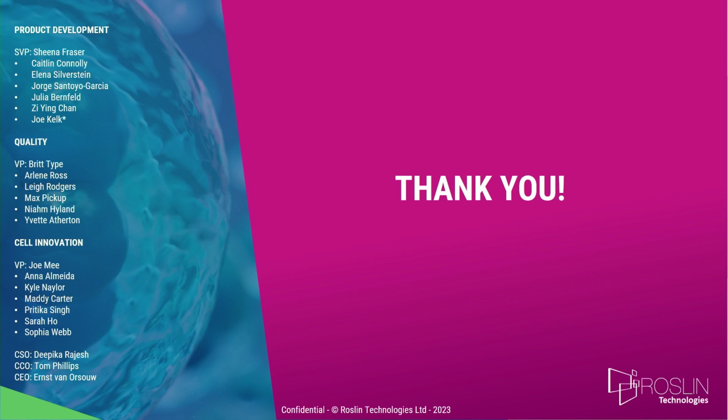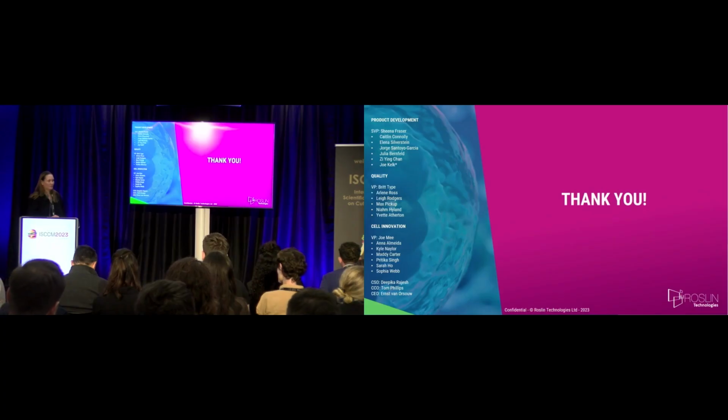There's another question up here. Perfect. Thank you for a very nice talk as well. I noticed you mentioned you had one passage point in your 3D data. Can you share a bit more, are you able to maintain them and passage the cells? I'm thinking in particular of seed trains that you want for upscale production.